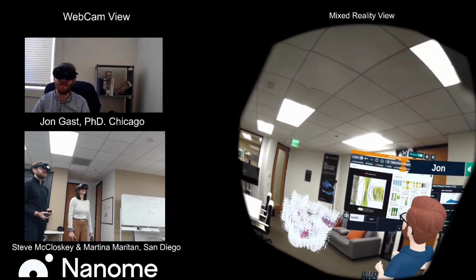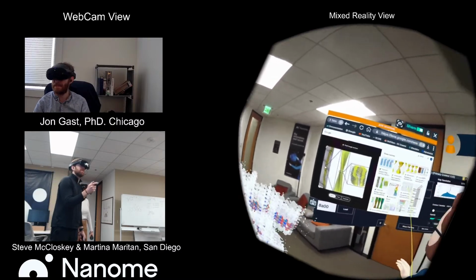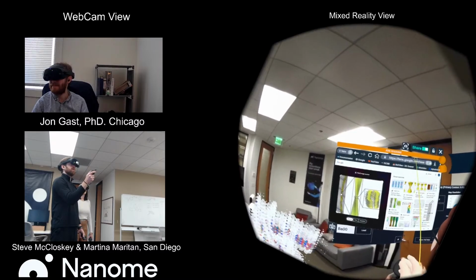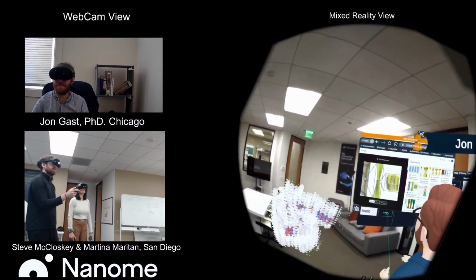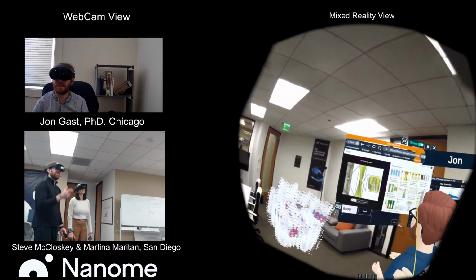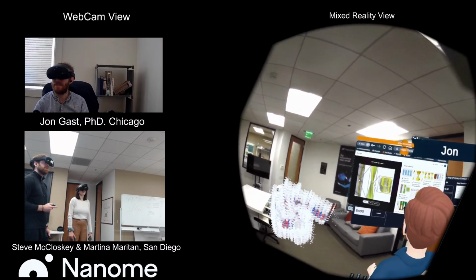It's so observable. Thank you to the authors of all these. We're literally just on Google search, so this is just a web browser to look up amyloid fibers. There's a collection of these, and thank you to all the various authors that have uploaded your images on the web.